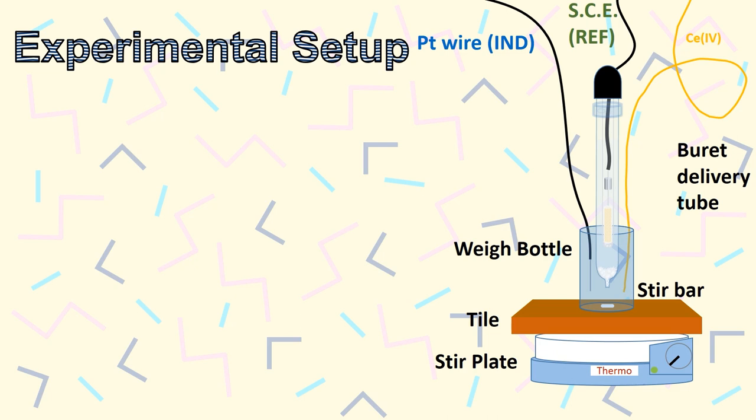After each analysis, you'll want to wipe off any excess solution on the SCE. To do this, gently dab the bottom of the electrode with a Kim wipe rather than roughly scrubbing it.